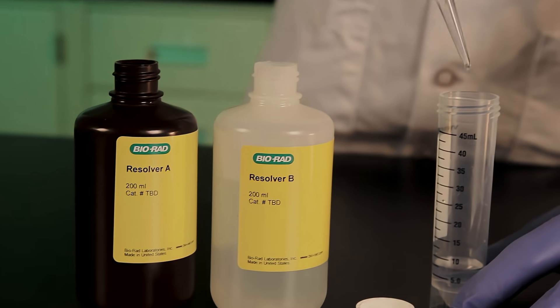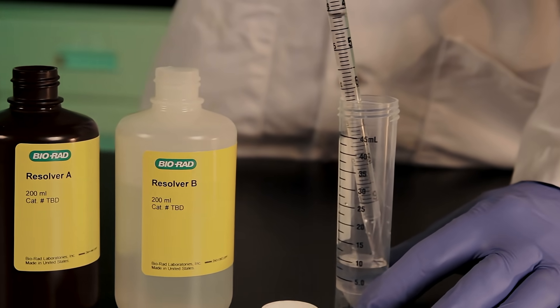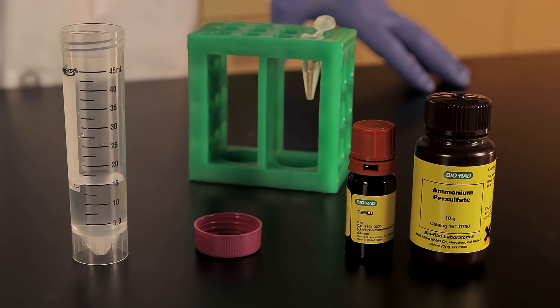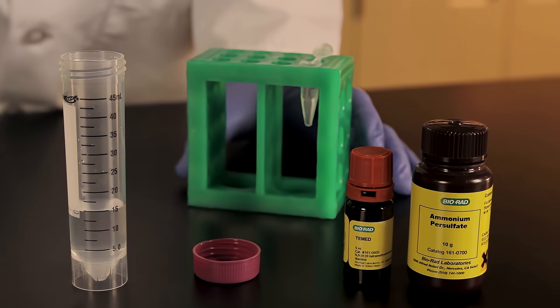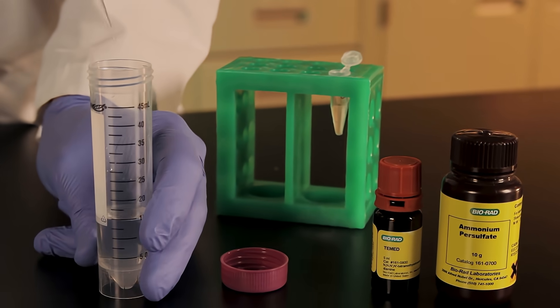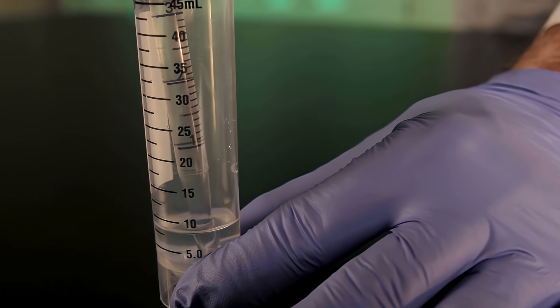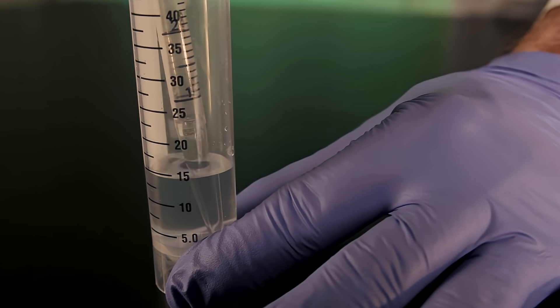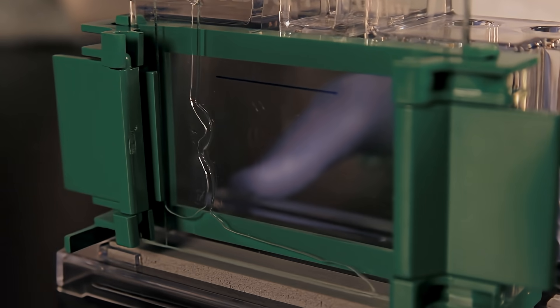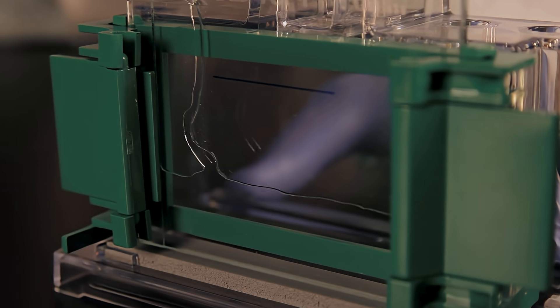Prepare the resolving gel acrylamide solution by combining equal volumes of resolver A and B solutions. Add the appropriate volumes of TEMED and freshly made 10% APS to the combined resolving solution. Mix the solution, taking care to avoid introducing air bubbles. Pour the resolving solution into the cassette smoothly to prevent it from mixing with air.